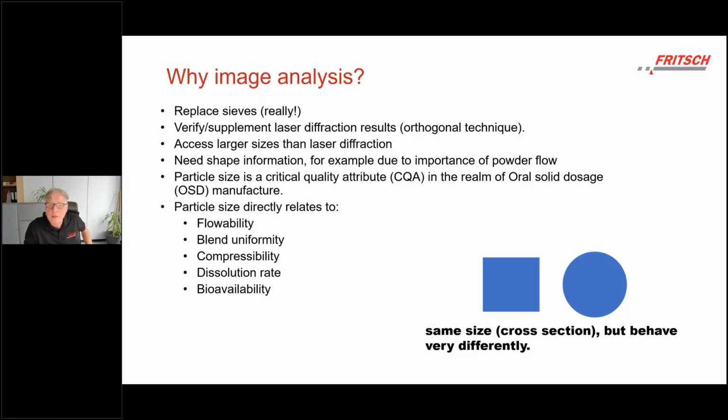Furthermore, of course, there are way more reasons to go with image analysis. If you look into laboratories for particle sizing, one of the most widely used techniques of all, at least what I typically see in laboratories around the world, is laser diffraction for sure.